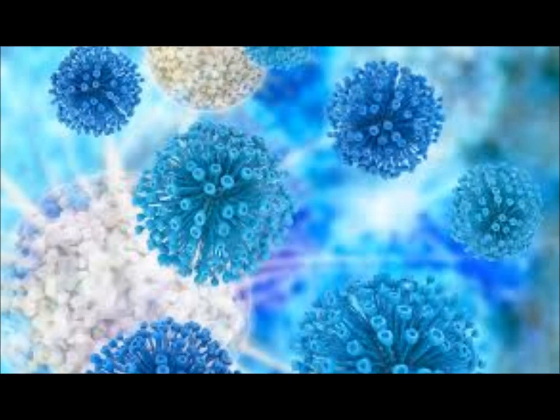On 53, at least look at size and color, every colony. Like she said, holding it up and looking on from the side view is a pretty easy one to see if it's raised or not. And then maybe take a look and see if it's smooth and round, or is it? Sometimes it'll have little projections.